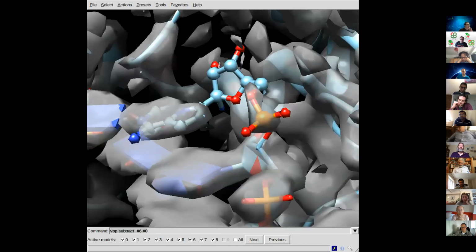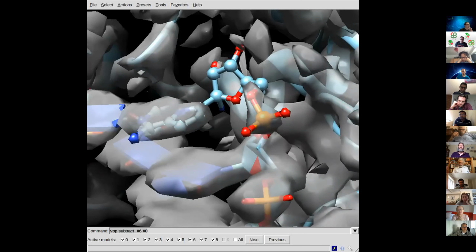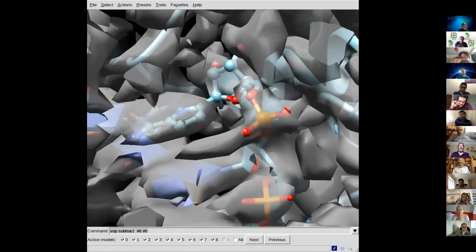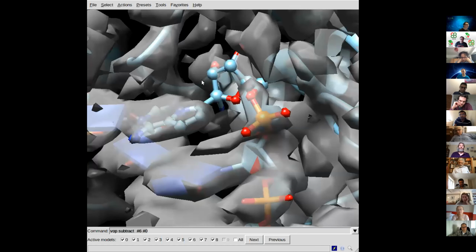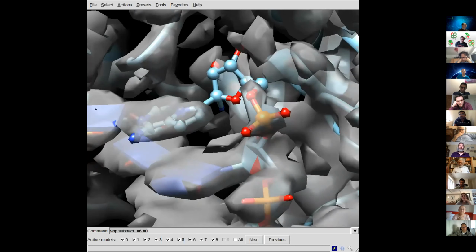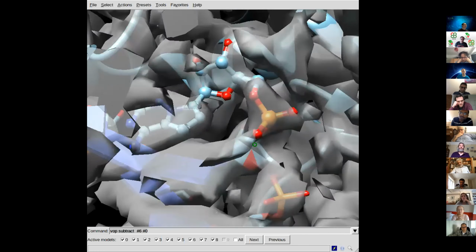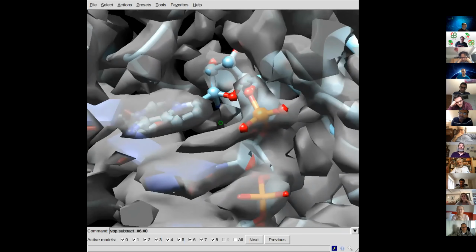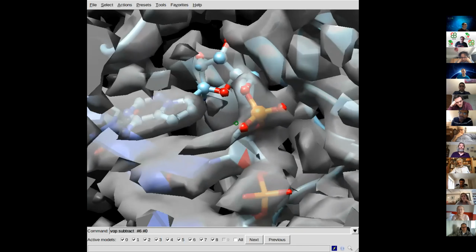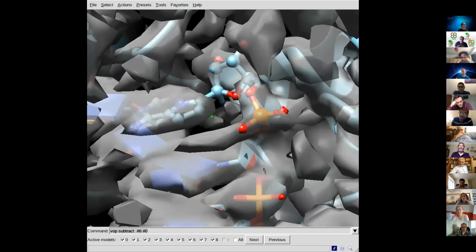That all looks good, and as people pointed out, the nucleotides are there really strongly, but the connection through the ribose is weaker. There's another density at this lower level that appears off this phosphate. I don't know if anybody's seen that and commented, what could that be? Is that what Ardon was thinking could be an alternative nucleotide position?